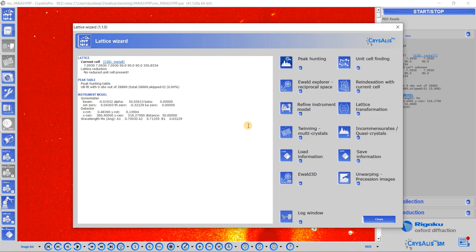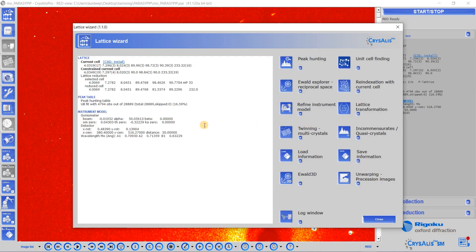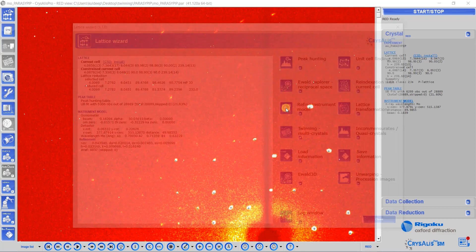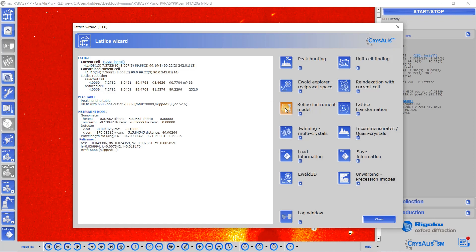The next step is Unit Cell Finding. Press this tab and it will find a unit cell. If you look at the cell parameters — 4, 7, 8, 90, 98, 90 — showing a Monoclinic P lattice. But the indexation is very low, only about 16%. Press the button 'Refine Instrument Model.' The indexation goes up to around 22% from 16%, so it's not improving — not a good indexation.